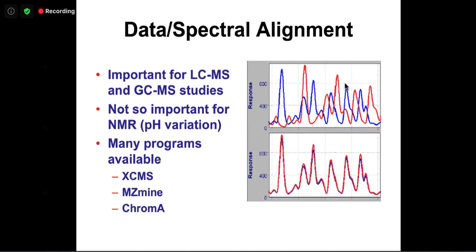So spectral untargeted metabolomics is fine if you're doing hundreds of samples, but when you go to thousands, in theory it is doable, but the computational cost becomes quite significant. And the tools, even including XCMS, are not able to deal with thousands of samples. That's the current issue, and I think a lot of researchers in this area are realizing that. But most of us won't feel it, because hundreds of samples are pretty good and thousands of samples are quite rare.